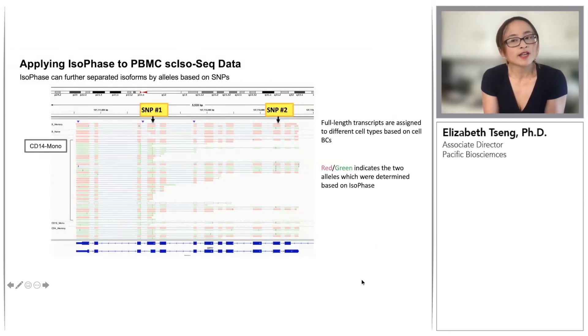Here is an example of applying IsoPhase to the PBMC-10X data I'd shown earlier. In this IGV screenshot, each alignment is an allele-specific isoform expressed in a certain cell type. Some cell types, such as the CD14 monocytes, had a much higher isoform diversity than the other cell types. Each allele-specific isoform is colored either red or green based on the two SNPs present in the transcribed region of this gene. While this is just a test case, we can begin to see how we may identify patterns of cell type-specific allele-specific isoform expressions.